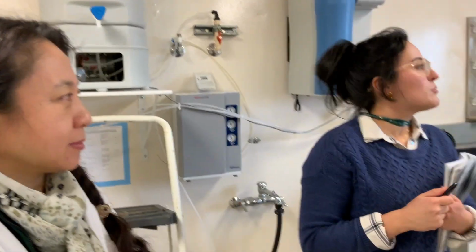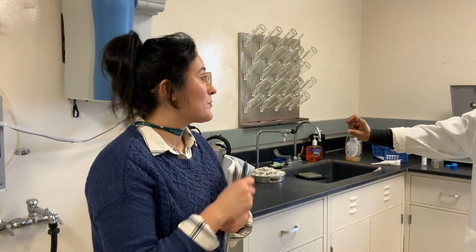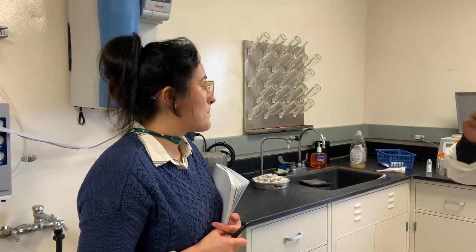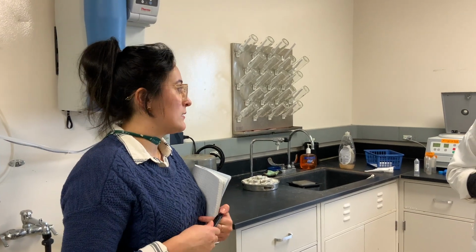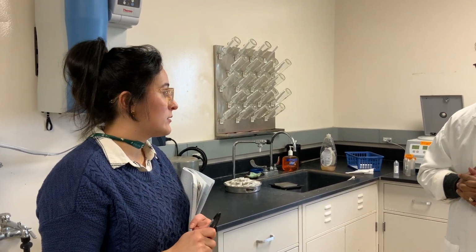So I actually have a turbidity meter. Yes. So you take a sample and you do some gravimetric analysis. This is a process that you have been doing, and this is like a batch type. You don't do continuous monitoring. I monitor once every day for the sewage and the effluent.